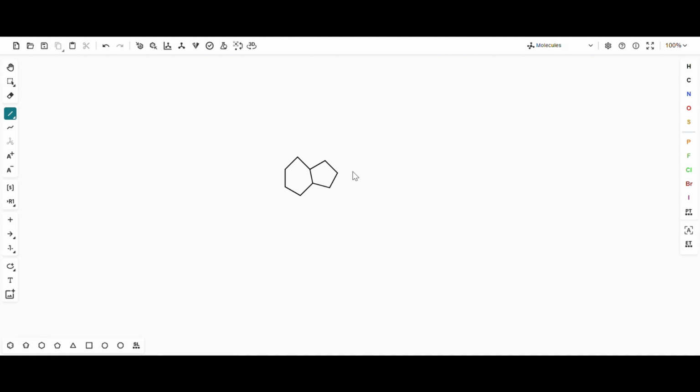As you can see, my drawing is not the best, but luckily, Ketcher has a cleanup option that, when clicked, will redraw my molecule nicely. I need to add a few more single bonds here, and a few more double bonds that I will select from the bond menu.